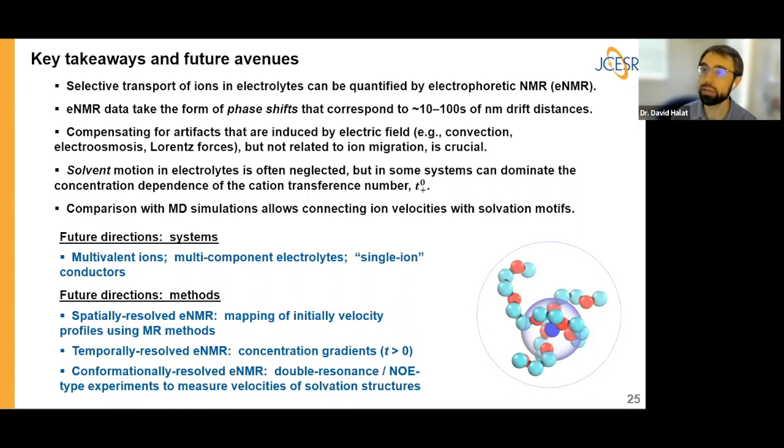For sure, there's not going to be as much signal to noise in a system like that. But in our experience, we've measured down into the 0.1 molar range. And then, for calibration purposes, people have done many measurements on tens of millimolar systems. So I think it's possible, but it depends on how fast the micelles move, is really what it comes down to.